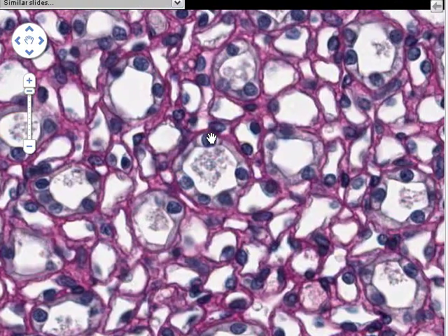And here now, if we take this tube as an example, if we were to classify the epithelium here, would we call it squamous or would we call it cuboidal? I don't know. I suppose there's a judgment call involved in this. One way that I look at it is to take a look at the overall size of the cell, judging particularly by the size of the nucleus if you can't see the cell borders. So here's one cell, 2, 3, 4. There's a 5th one here. The nucleus is out of the plane of section. 5, 6, and then maybe a 7th one, and the nucleus is out of the plane of section.